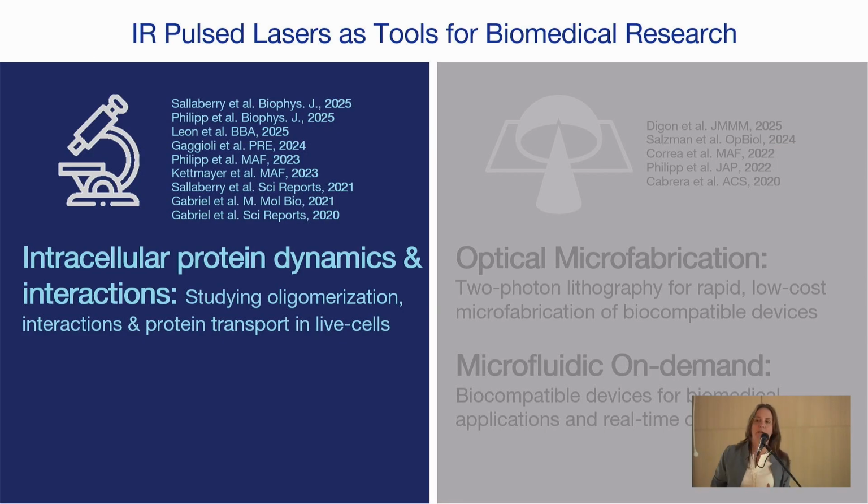Okay, so in my group, we use infrared pulse lasers as tools to address biological questions. The main interest of our group we can divide into two main categories. One is to study intracellular dynamics, protein transport, protein-protein interaction, protein-membrane interaction, protein oligomerization. And on the other hand, we use infrared lasers as a tool for optical fabrication of micro devices.